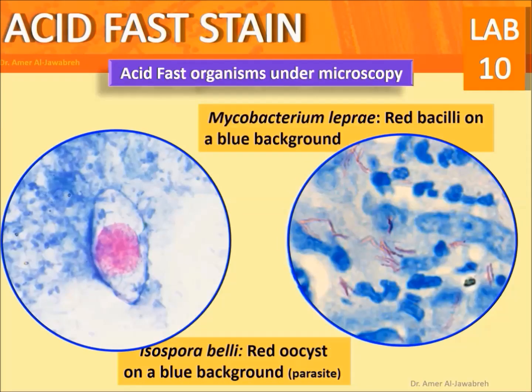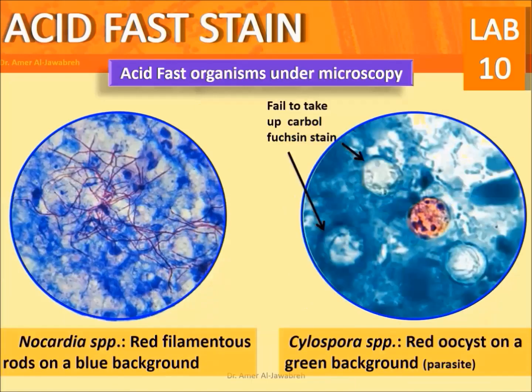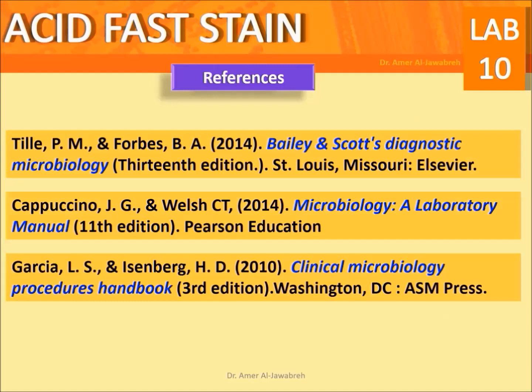Mycobacterium leprae: red bacilli on a blue background. Isospora belli: red oocysts on a blue background (parasite). Nocardia species: red filamentous rods on a blue background. Cyclospora species: red oocysts on a green background (parasite). Thank you.